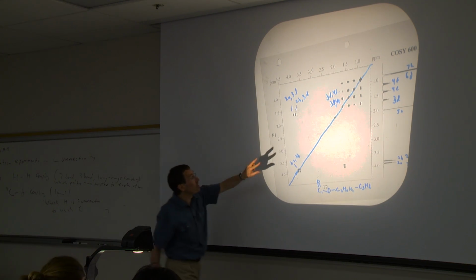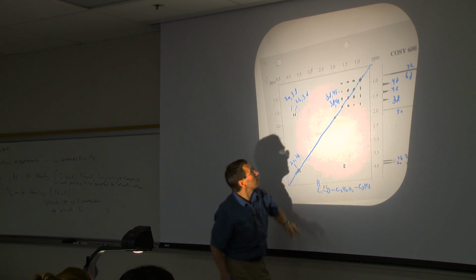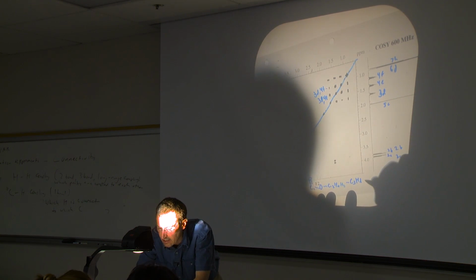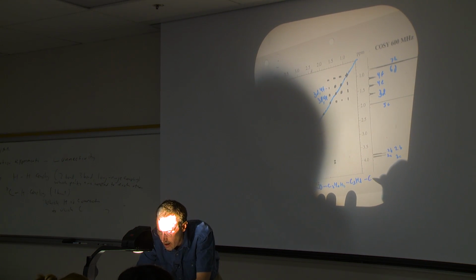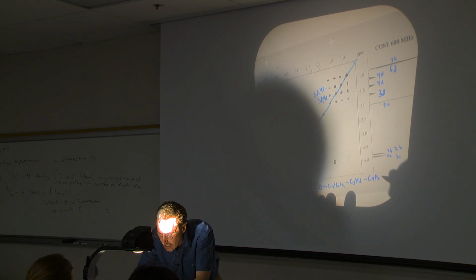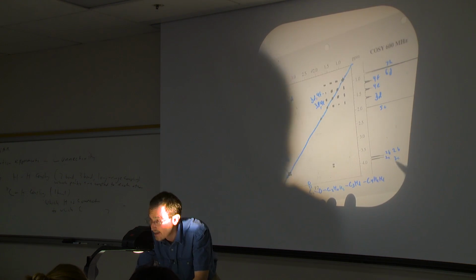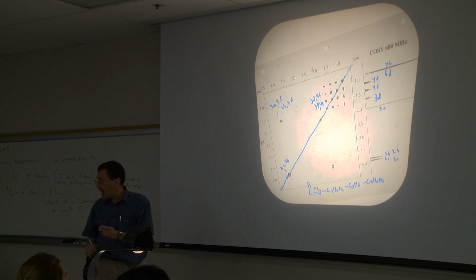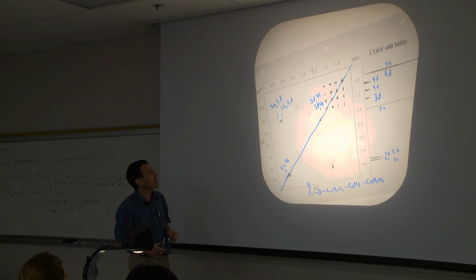And the next set of cross peaks that I've already marked continues to build up our connectivity. It says that C3HD is connected to C4HE and HF. In other words, without having to interpret patterns, our cross peaks are basically walking us through the construction of the chain here.